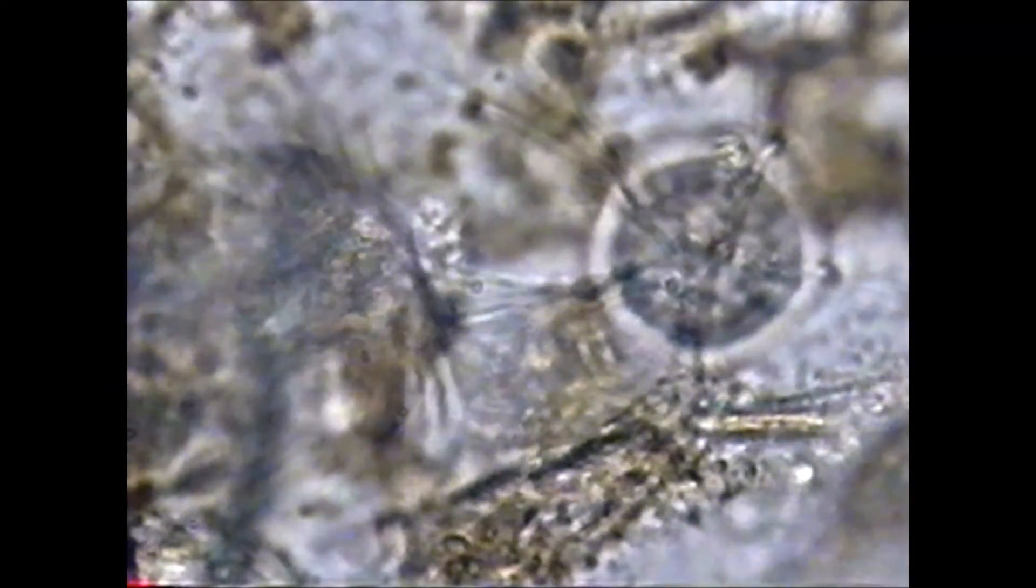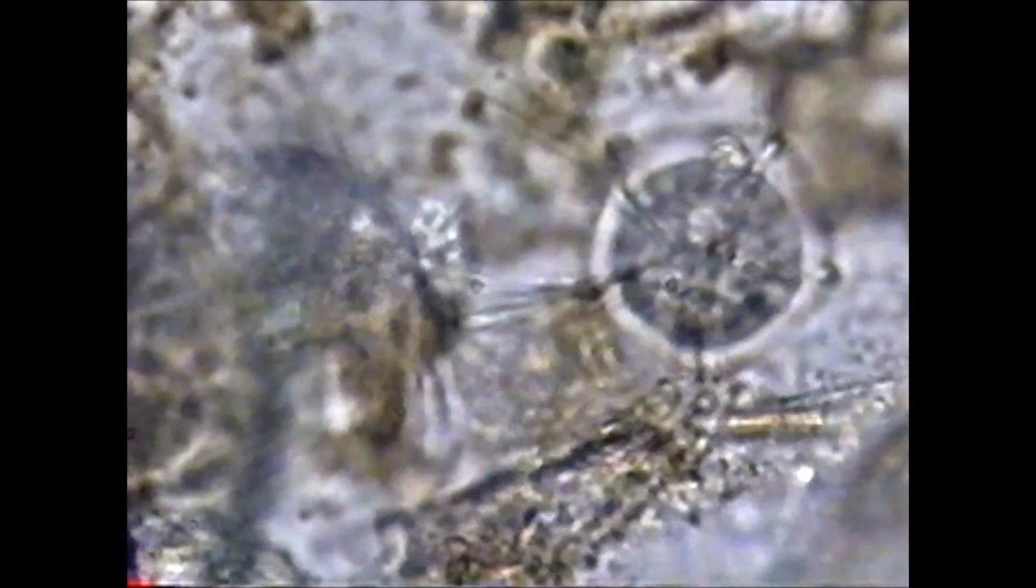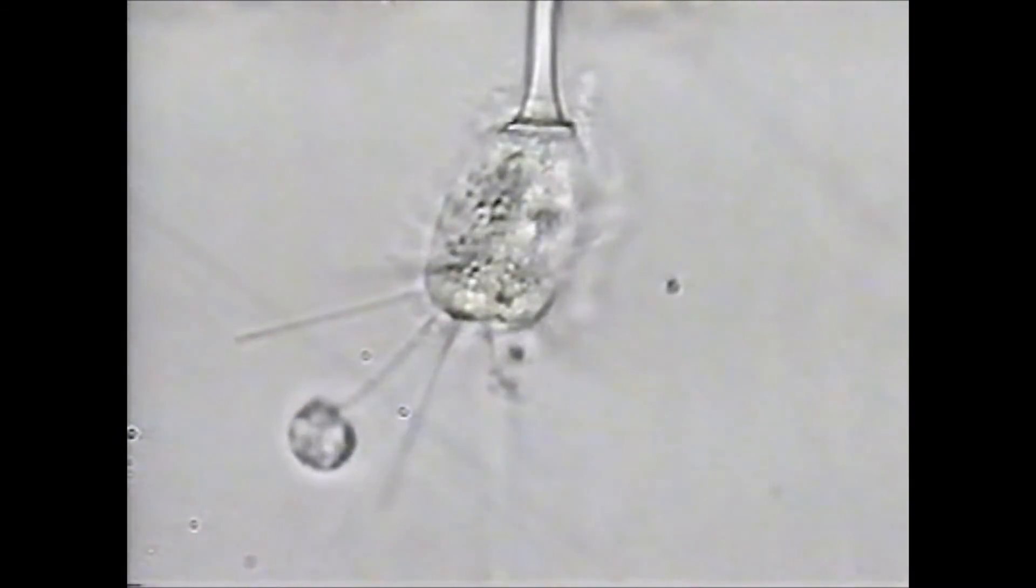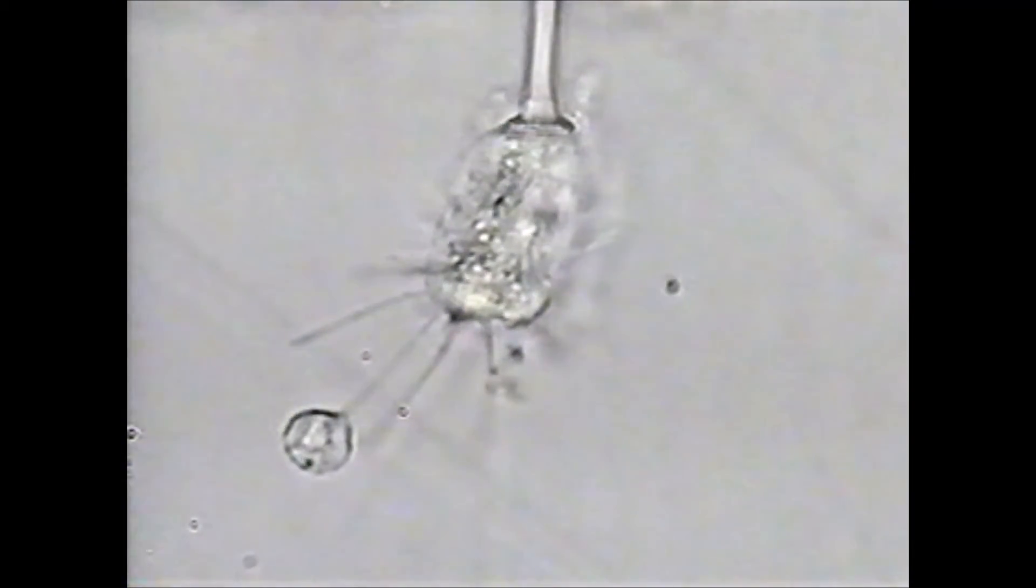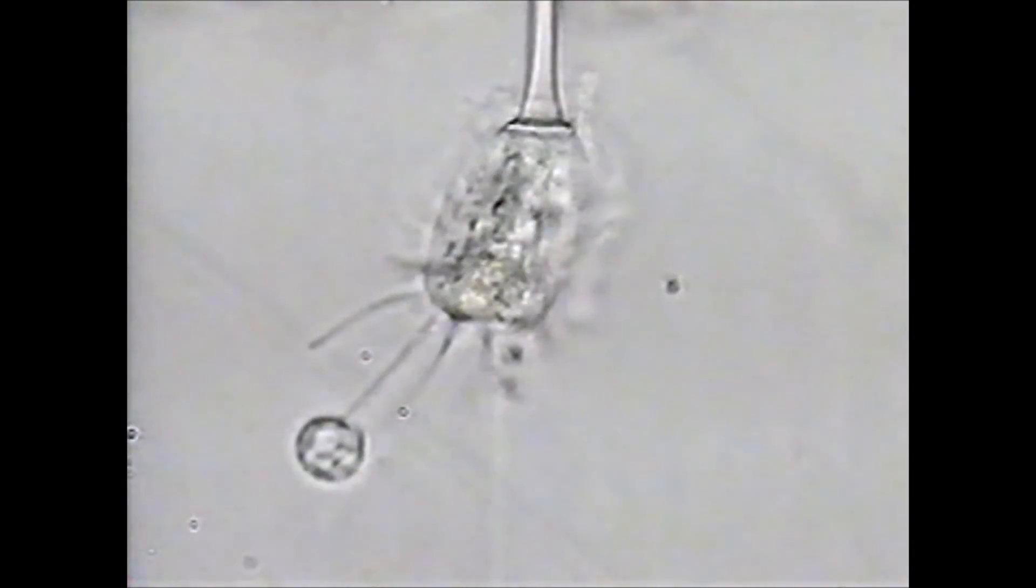Some have a stellate lorica or shell. Another one with prey. Another one with prey tentacles.